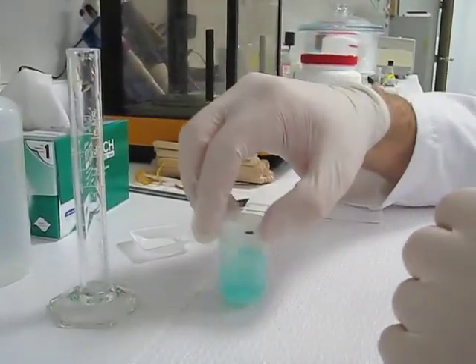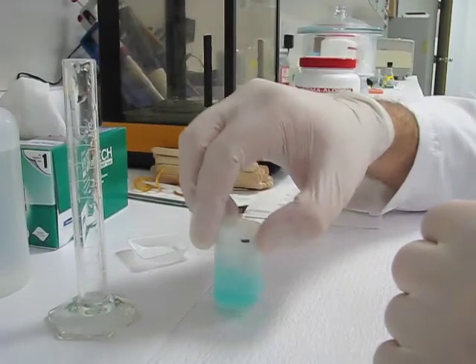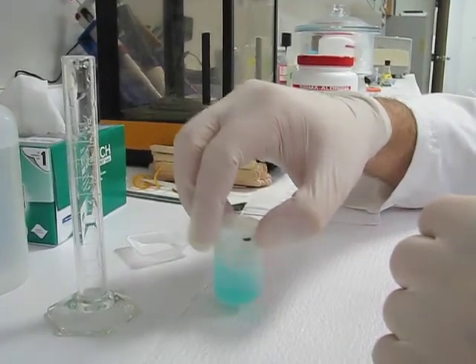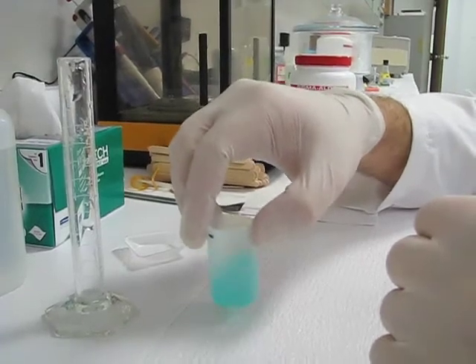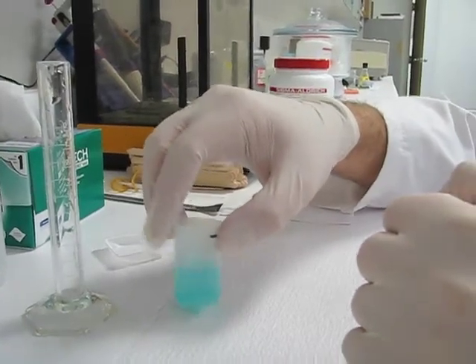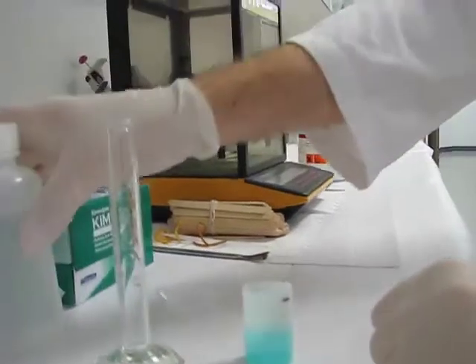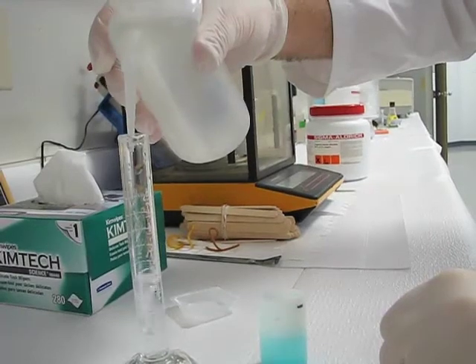I want to dissolve it a little bit first. A standard practice with chemicals is you want to dissolve it as much as you can with your volume, because things don't mix one to one all the time. So the right way to do this is to dissolve as much as you can, then when it's dissolved, you bring the final volume to your desired standard — in this case, it's 20 milliliters.